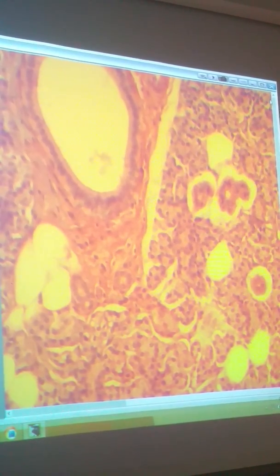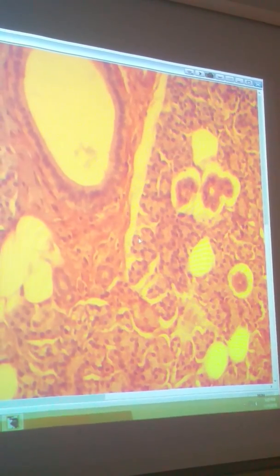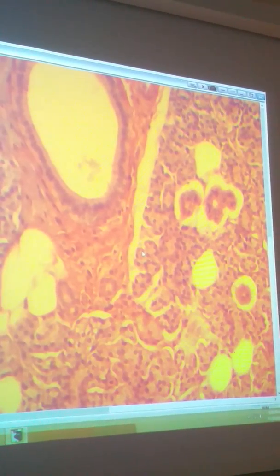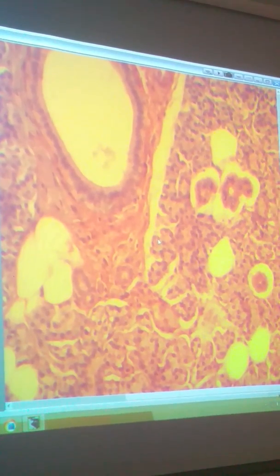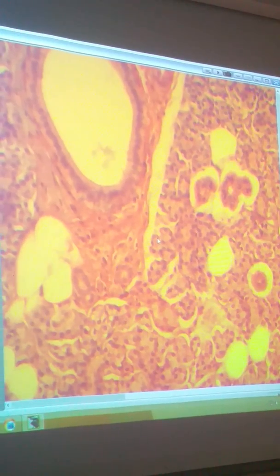Everybody gets this? Well, what is the serous demilune? The serous demilune is like a baseball cap on top of a mucus acinus. That's all I like to say. I'll find one in a second for you.